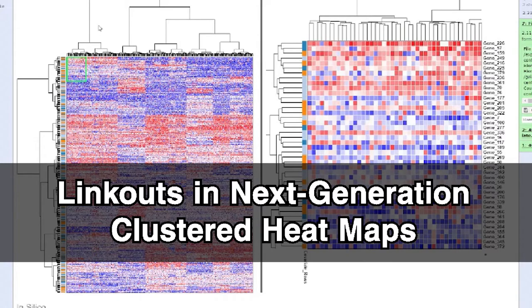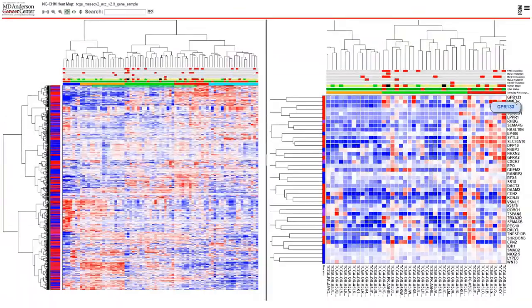In this video, we will be going over link outs in next generation clustered heat maps. Link outs are associated with either row or column labels, and in this video we are showing a heat map using samples and genes as labels. A key feature of the NGCHM system is that you can easily link out the information related to the data in the heat map.